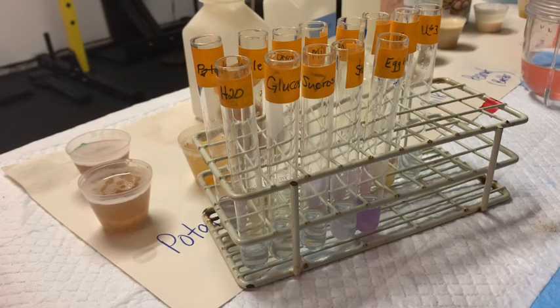We're now going to move on to a test called the iodide test and a test called the Benedict's test. Iodide is going to test for starches, and Benedict's is going to test for the presence of reducing sugars.